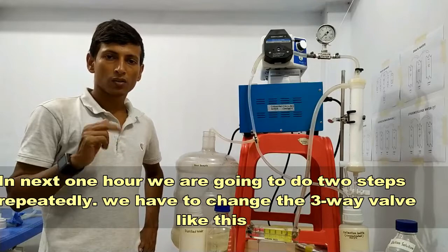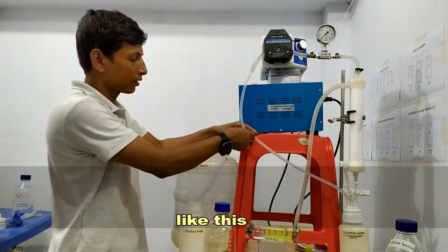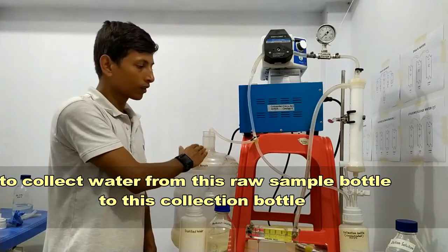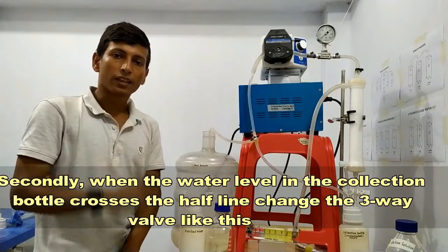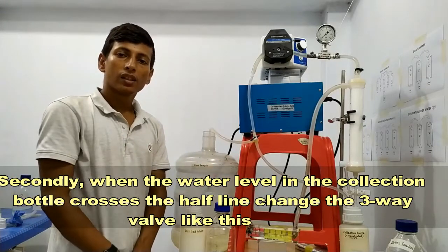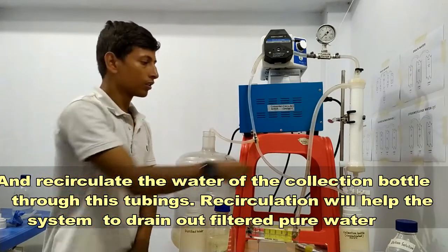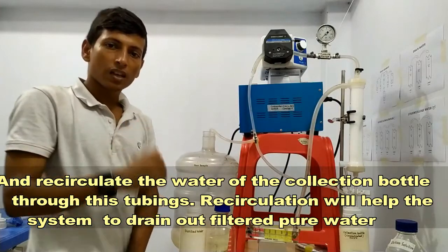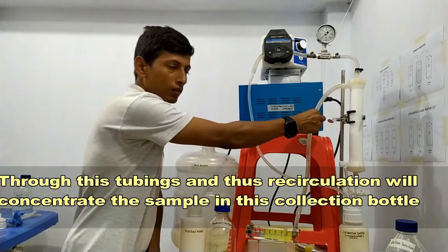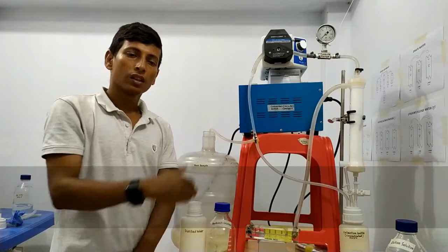In the next one hour we are going to do two things continuously. First, we have to change the three-way valve to transfer water from the raw sample bottle to the collection bottle. Second, when the water level in the collection bottle crosses the half line, change the three-way valve to recirculate the water of the collection bottle through the tubing. Recirculating will help the system drain out filtered pure water through the tubing, and thus the recirculation will concentrate the sample in the collection bottle.